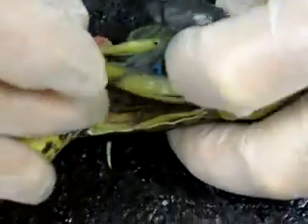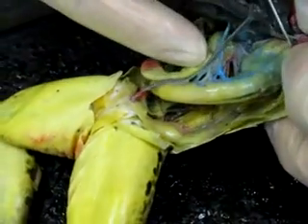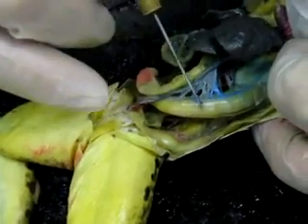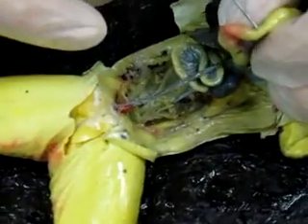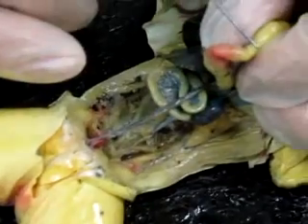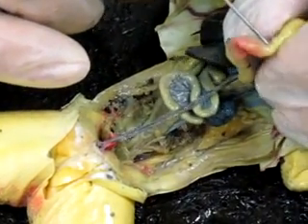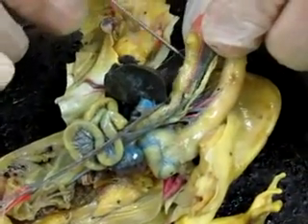Now we turn to the left side and we find the stomach. This is the stomach. The esophagus comes down from up here. The cardiac sphincter will be located up here. The stomach will come around like this. And the pyloric sphincter, the little ring of muscles here at the base of the stomach, regulates the flow of material out of the stomach into the first section of small intestines called the duodenum.